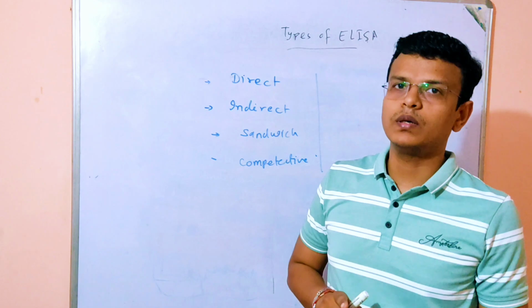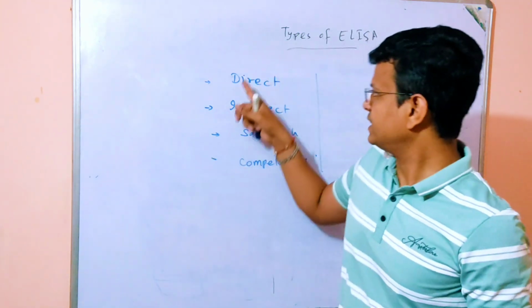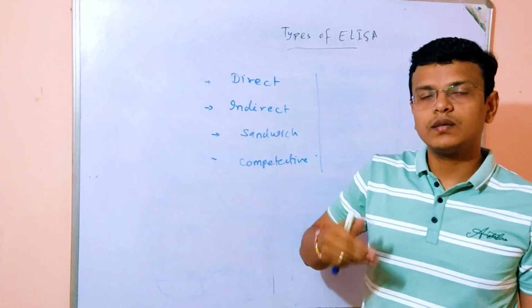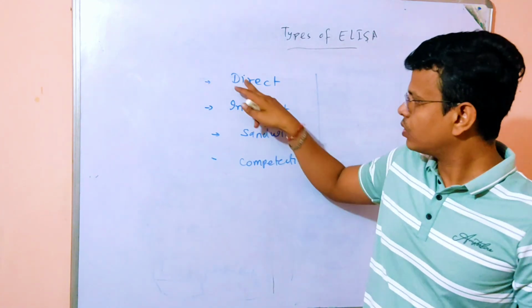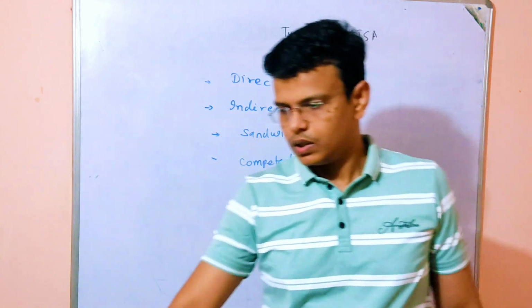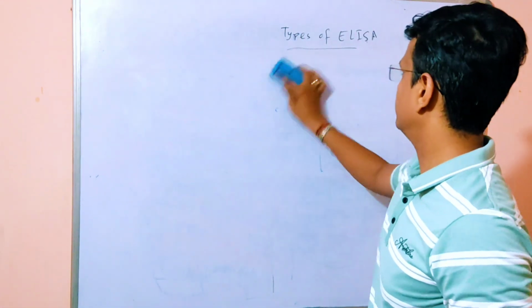In various question papers, especially in written examinations, each topic is asked as a short note. I will make videos on each topic later on. So now we will discuss each topic in short form. Let's start with direct ELISA.